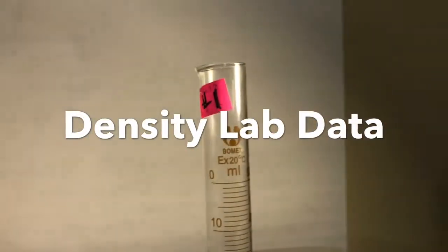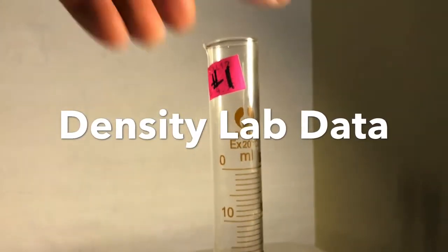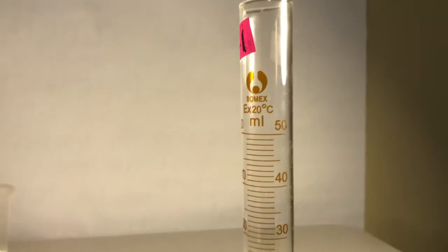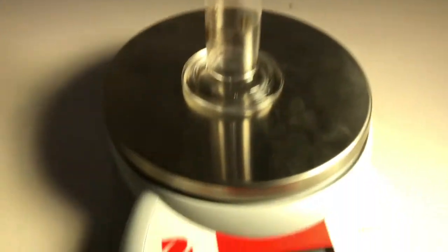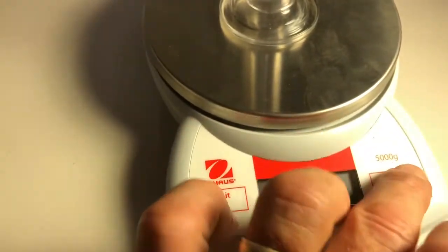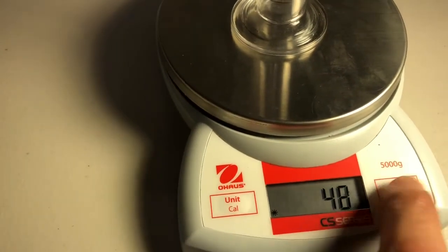Welcome. Check it out. There's your graduated cylinder. It's going to read in milliliters up to 50. Milliliters and cubic centimeters are the same. I'll prove it to you sometime, but not today. Here's our big scale, which is reading in grams, and that's telling me how heavy that thing is right now, right? But now watch.